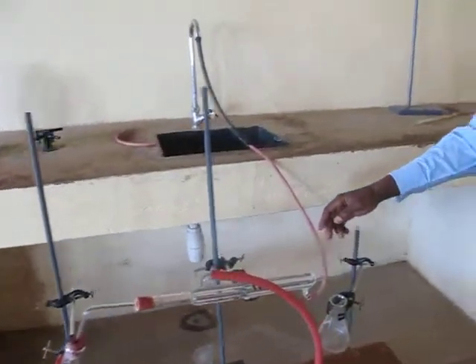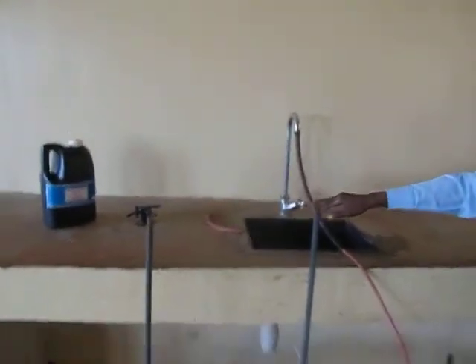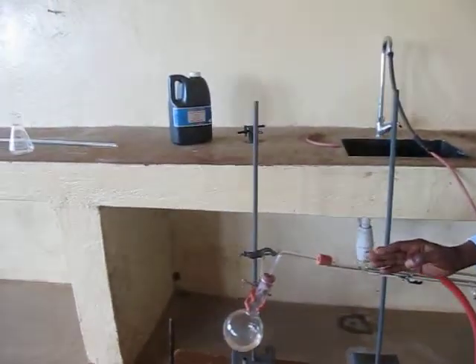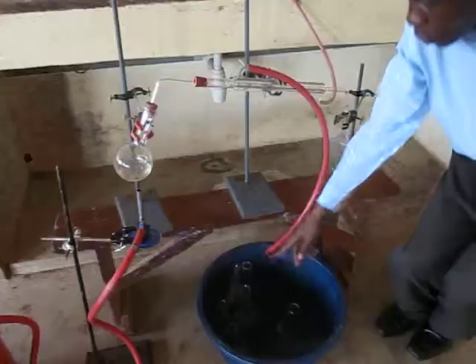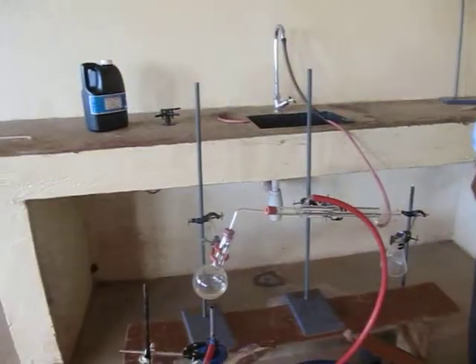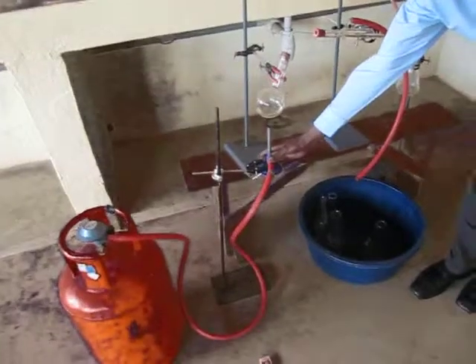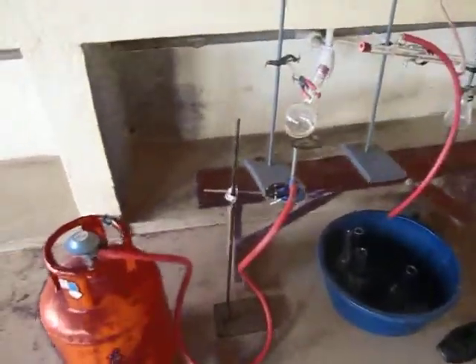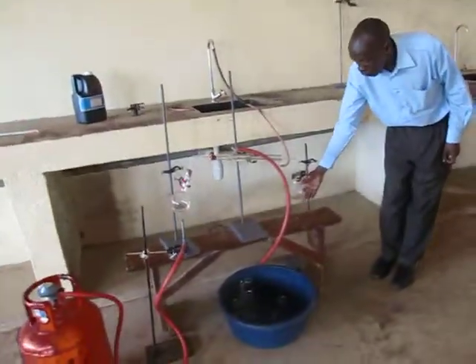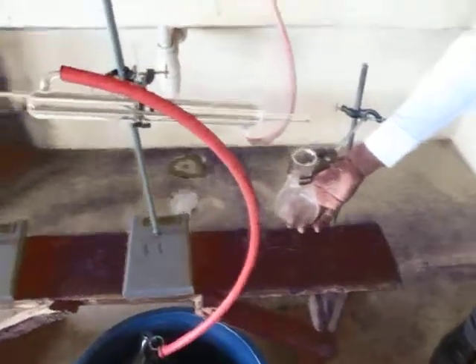You can also see some piping, like we shall be having water running from the tap, down the pipe, moves up the condenser and out. So the flow of water should be continuous during the process. We also have a Bunsen burner which will act as a source of heat. And on this other end, we are going to use a conical flask. This is where we will be collecting our distillates.